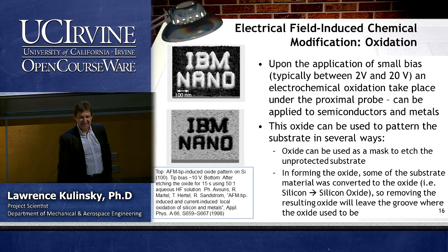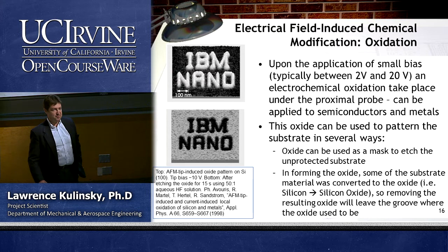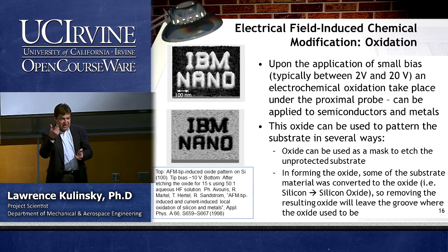So I was thinking, when I saw that, in my opinion, it's obviously wrong, but in my opinion it wasn't the silicon dioxide formation that made that etch, that imprint, IBM Nano. I thought that when you etch with HF, it etches everything at an equal rate. Oh, okay, no. Sorry, I was thinking out loud right now. Okay, no problem. But it was the oxide. It actually etched out the oxide.